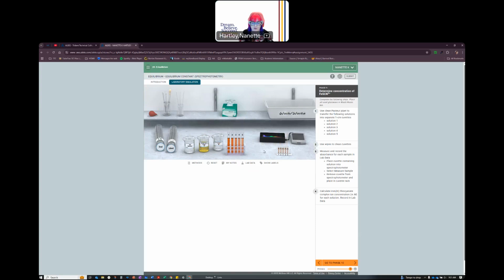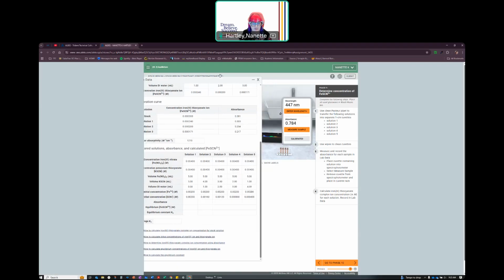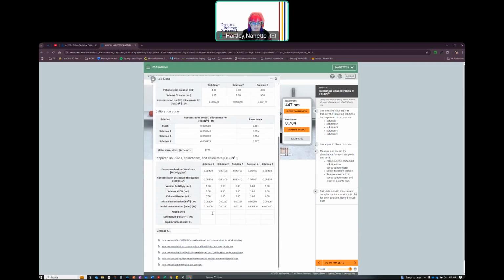Okay, so now we've got these. We're going to clean them up, which we'd already done, but okay. Now I can put this in here and I can measure that. And so I can go to my lab data, and over here, I can say 0.784.